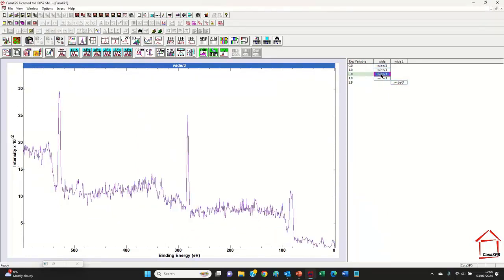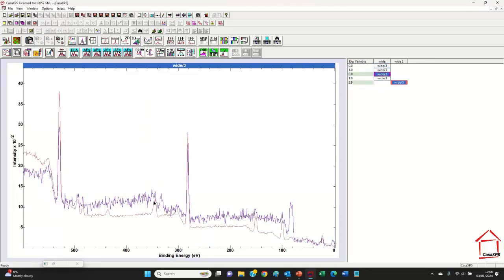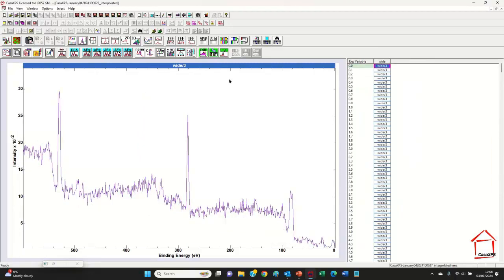So now I can look at the gold and say I want to remove from the gold a little bit of the silver also. Perhaps not. I was anticipating this to be silver, but this does not appear to be silver. In fact, it's probably a gold signal. So that makes me feel quite comfortable that I've got within this blue spectrum gold and a bit of glass. So let's use the gold and the glass to remove these small peaks here, again using difference spectra.